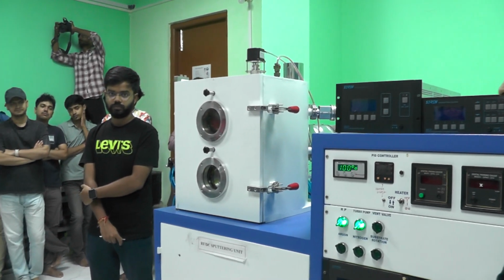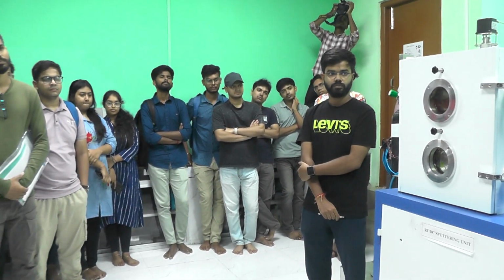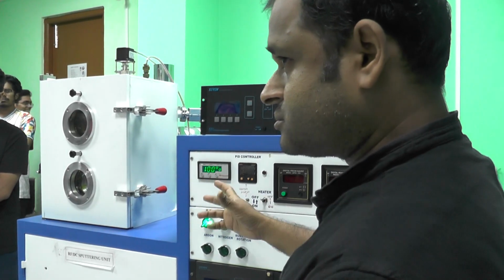So what we are doing, basic steps involved in sputtering. First of all, we have to introduce inert gas, like here we are using argon. At a high voltage, when we bombard our target material, it ejects atoms or molecules towards the substrate, because here we are using negative and positive polarity. Negative means the cathode is connected to the target material, while the body is connected to the anode. So this principle is behind that.